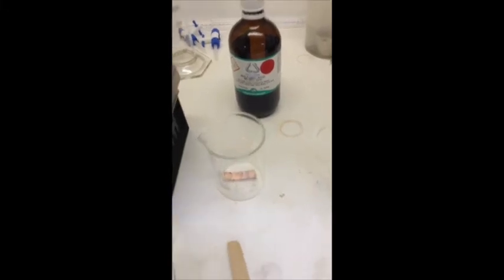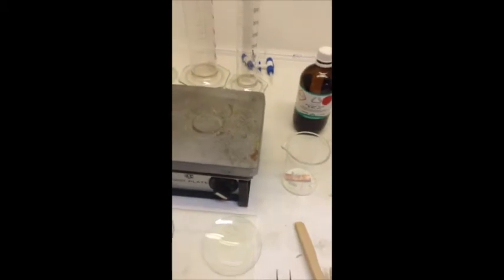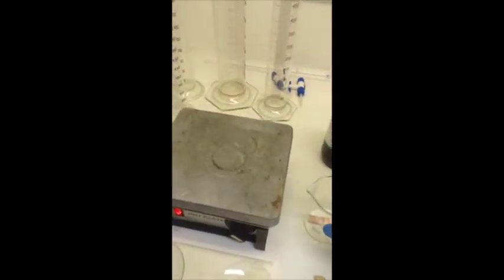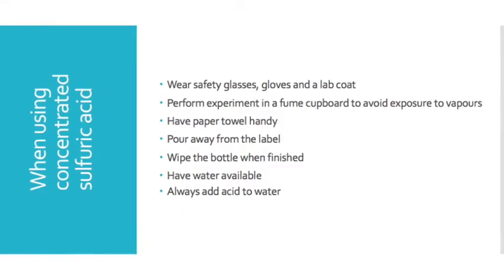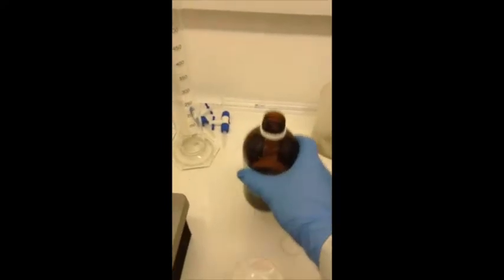Hot concentrated sulfuric acid can be used as an oxidizing agent with copper metal. Add the acid to the beaker containing the polished copper metal and then transfer this mixture to the hot plate.